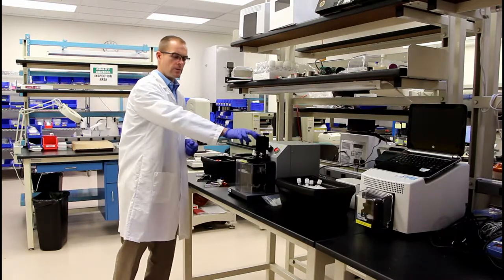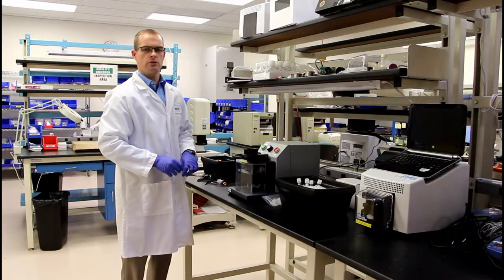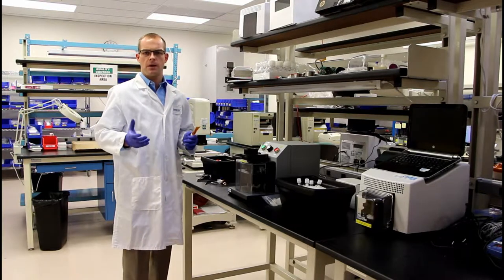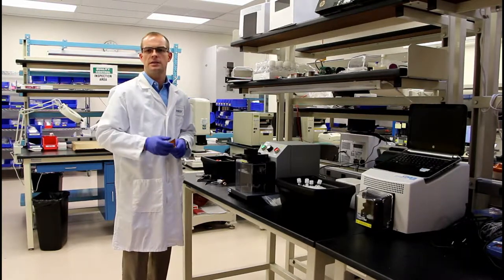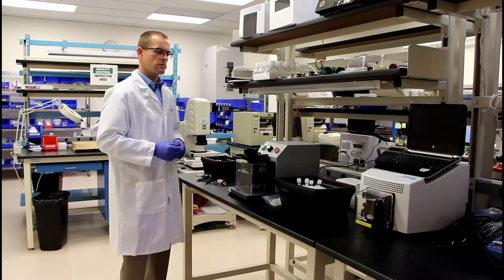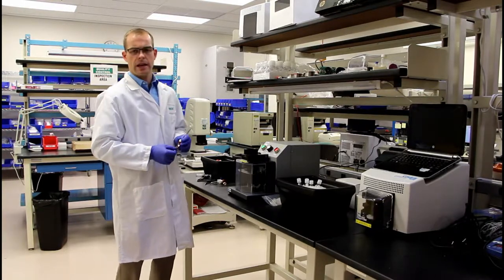The Covaris Cryoprep is an instrument that is used for dry tissue pulverization, typically for extraction of biomarkers such as proteins, DNA, RNA, anything that's heat sensitive, anything that you want to produce more results with, or anything that you have to scale.